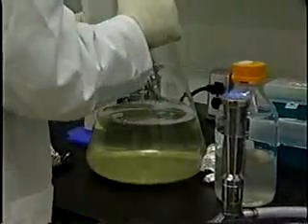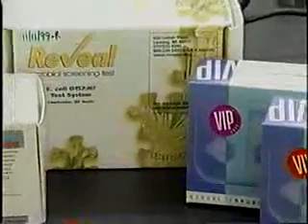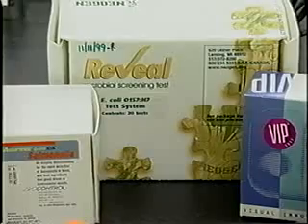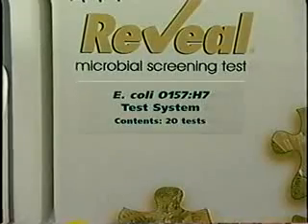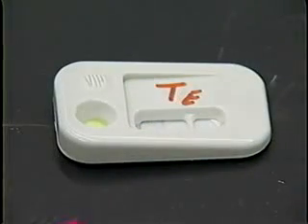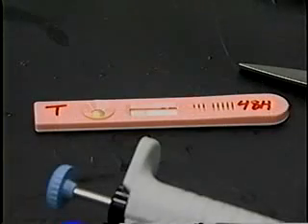the testing protocol. The rapid test kits described in the FDA guidance document all require use of an overnight enrichment step to promote growth of the target pathogen to detectable levels. These test kits cannot be used without this enrichment step to detect pathogens in irrigation water or sprouts. The testing procedures recommended by FDA were chosen to obtain results on the presence or absence of Salmonella and E. coli O157:H7 as quickly and simply as possible. They are screening tests. If the results are negative, these results are assumed to be correct.